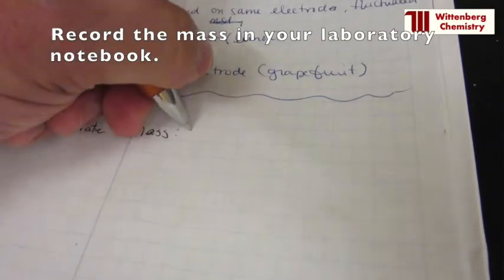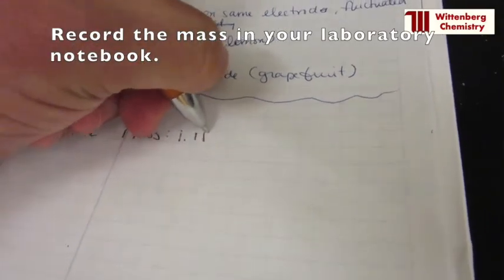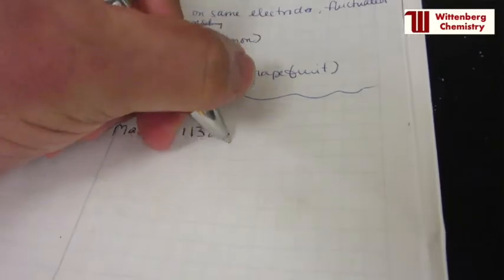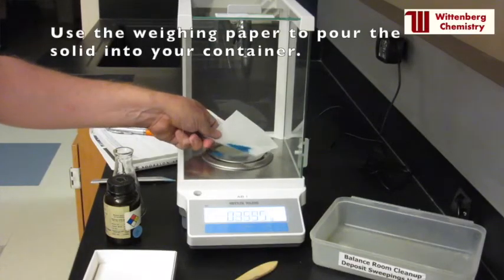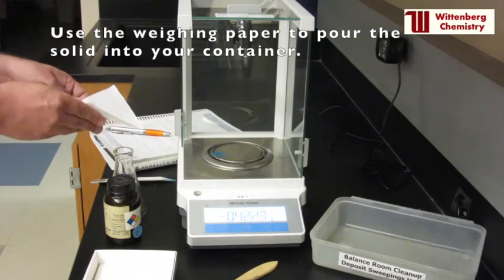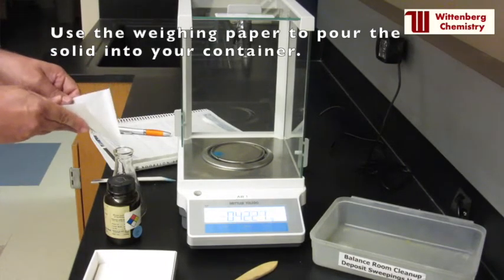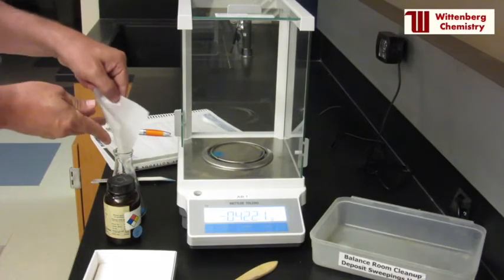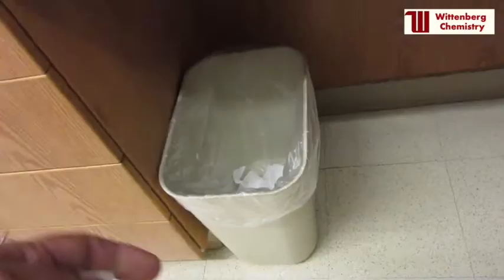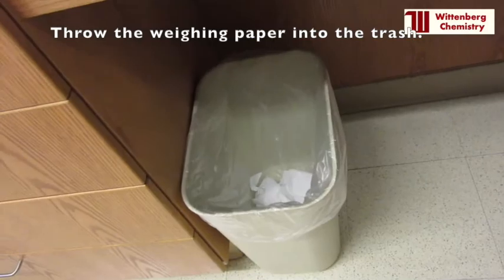Write the final mass in your laboratory notebook. Use the weighing paper to pour the solid into your flask or beaker. Throw the used weighing paper into a trash can.